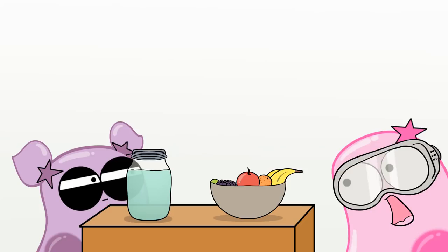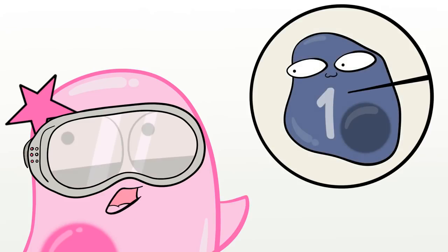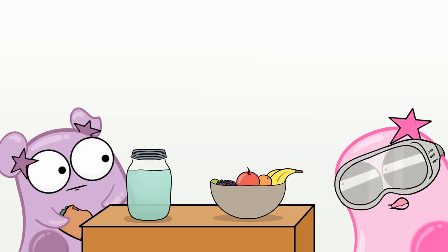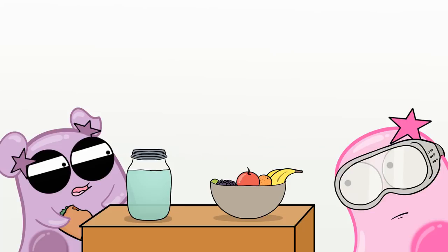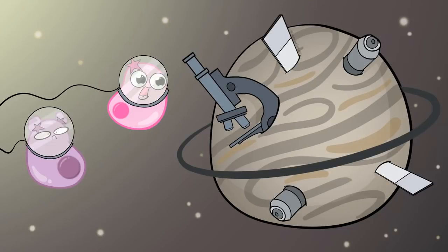The protists that I'm looking for are unicellular, meaning they're made up of one cell. And generally, you need a microscope to see them. Huh. Never used one of those. You've never used a microscope before? No. Well, you know what that means. I'm afraid of what that means. We must explore the world of microscopes.